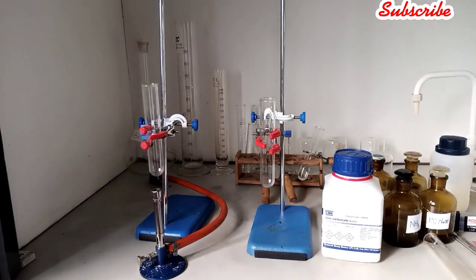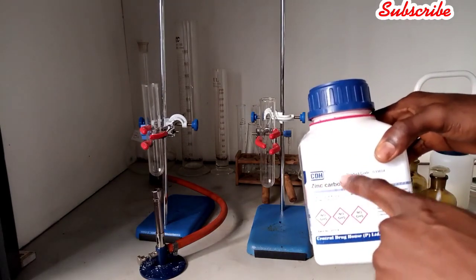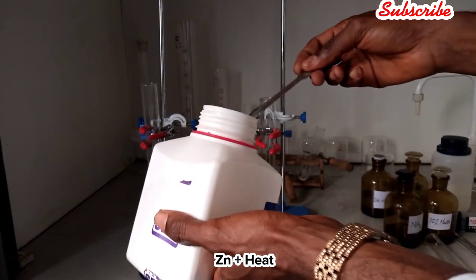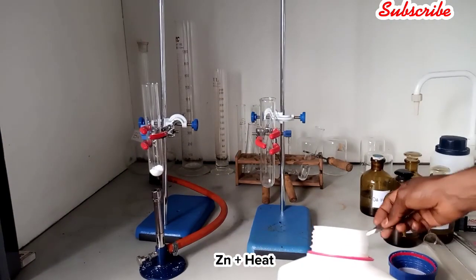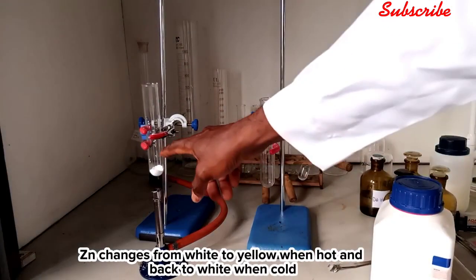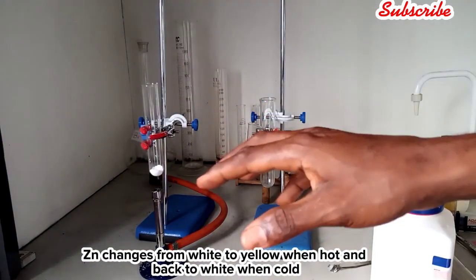Alright, we'll go for the test for Xn, which is zinc carbonate. Now the cation here is zinc, while the anion here is carbonate. So we'll test for zinc and we'll test for carbonate. First, you will be asked to add a spatula full of zinc carbonate into a boiling tube. And you'll be asked to heat for a while. Now you observe, if you heat it, the color will change from white to yellow when hot and back to white when cold.